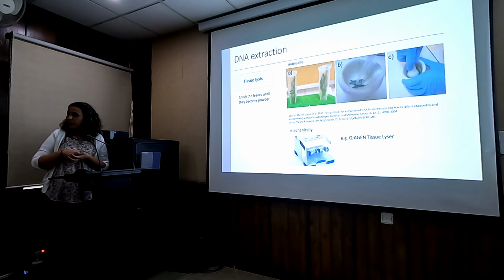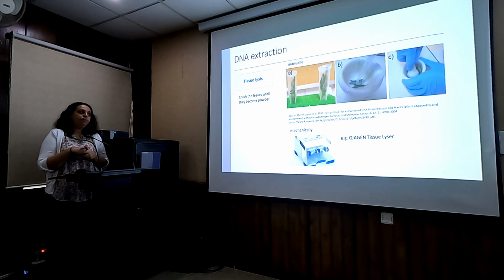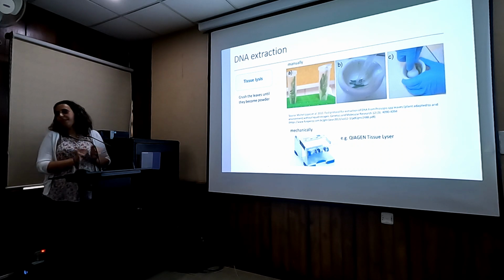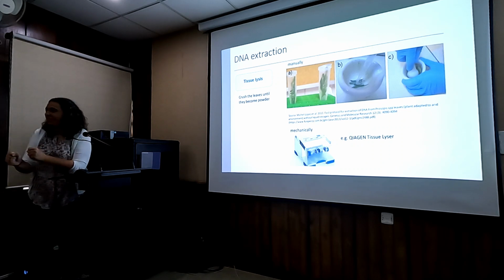It helps a lot. So you add a bit of sand or silica beads, and they all go away afterwards in the extraction process. So that's okay. You can keep the silica and the sand in. And then if you have this machine, you can throw lots of samples in there. It goes. Yes, we are having this. You have this one. Oh, that's so much fun.